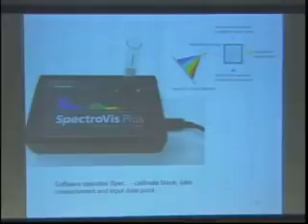For this experiment, we're going to use micropipetters to add various volumes, so make sure you use the tip. We'll be using the specs again. So remember, you can use the specs to quantitate or identify. In this case, it will be the quantification of it. And you should sort of remember that formula.